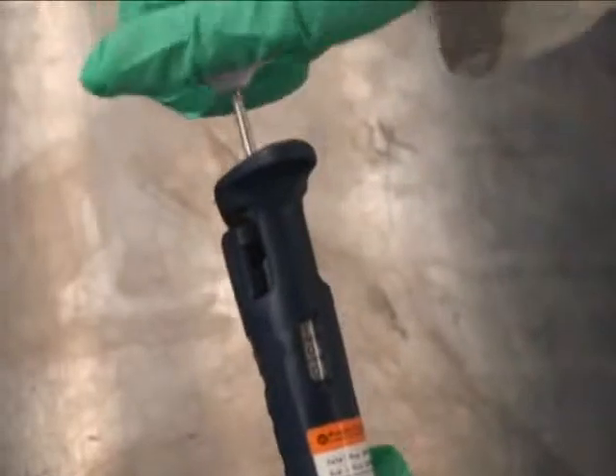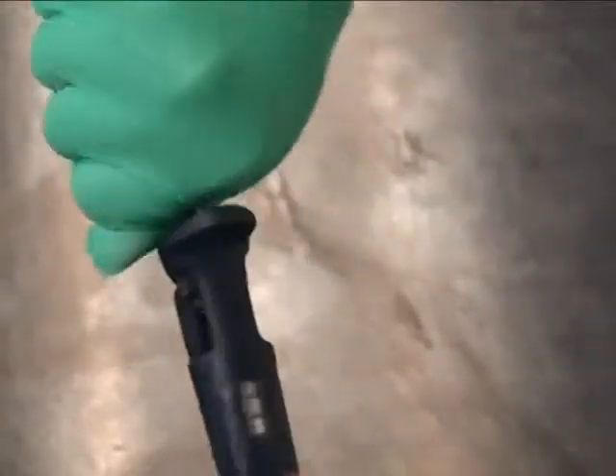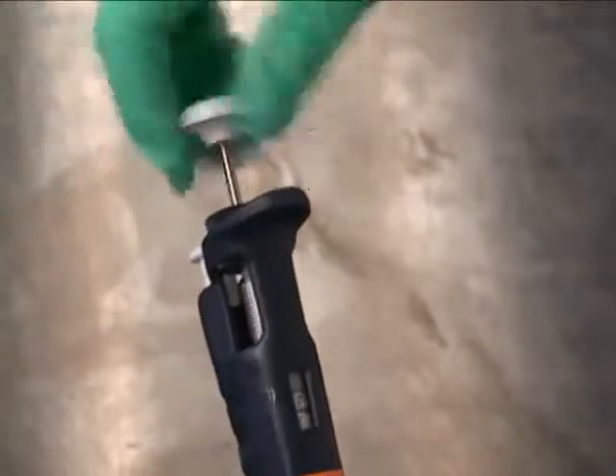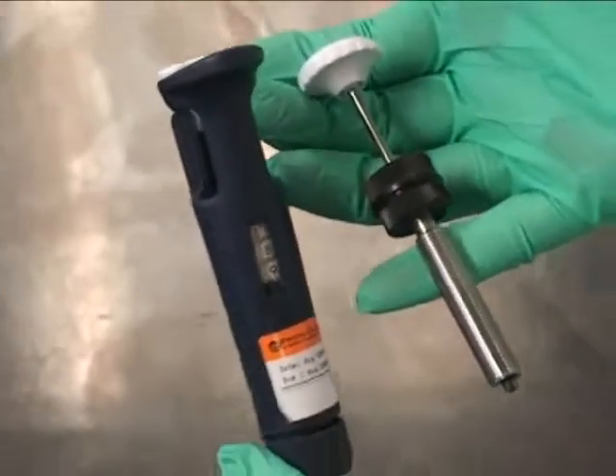This is what happens to a P1000 as it goes well past the 1000 level. As you can see, it takes a lot of effort and it makes the pipette entirely useless. Now it must be recalibrated and reassembled.